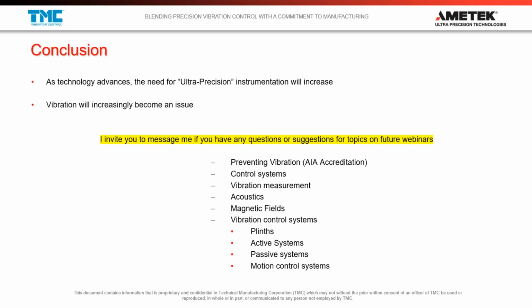You know, if you think you have a vibration that occurs every night at say 4 a.m. and you see that in your measurement, you've run a measurement overnight and you see that there's a disturbance at 4 a.m., you might want to start looking into, well, what's happening at 4 a.m. that's causing that vibration? And it could be something as simple as a cleaner moving some equipment that happens every night there and things like that.